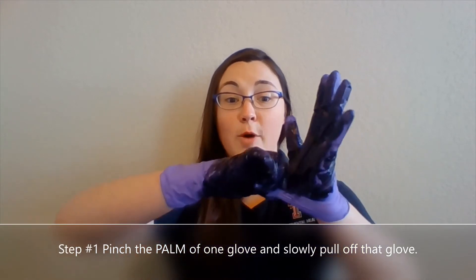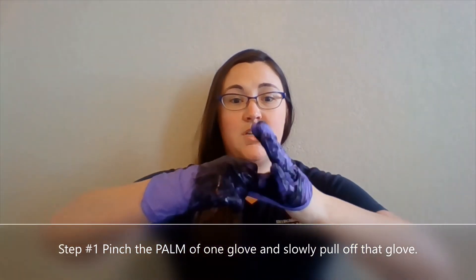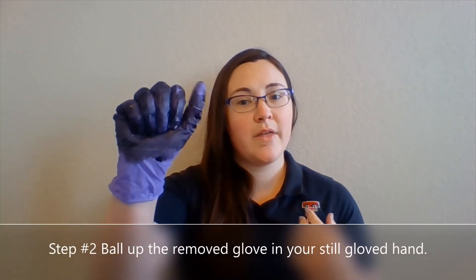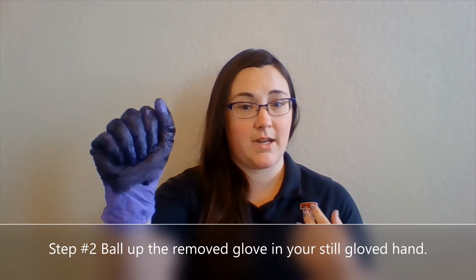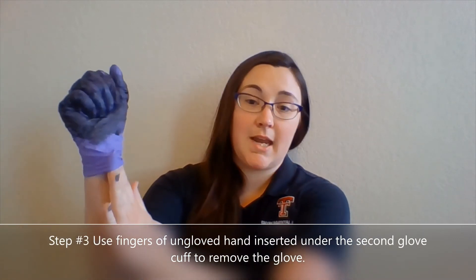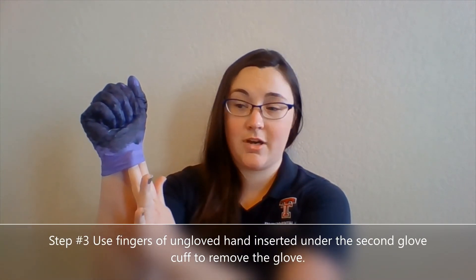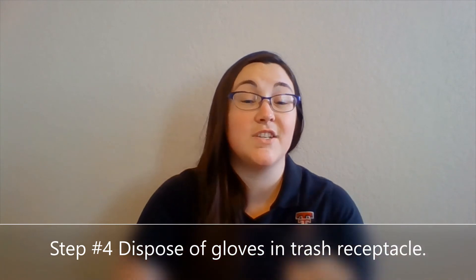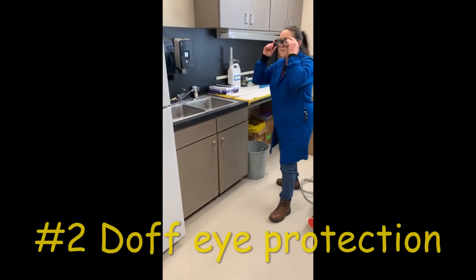You want to pinch the palm of one of your gloves. You never want to go from the very bottom because then you'll touch your skin. Pull off that first glove slowly — otherwise you're going to aerosolize whatever contaminants happen to be on your glove. Bottle that glove up in your still-gloved hand. I call this clean hand, dirty hand. Take your clean hand and slide it underneath the cuff of your other glove, then pull that one off inside out as well. Dispose of your gloves into a trash receptacle.